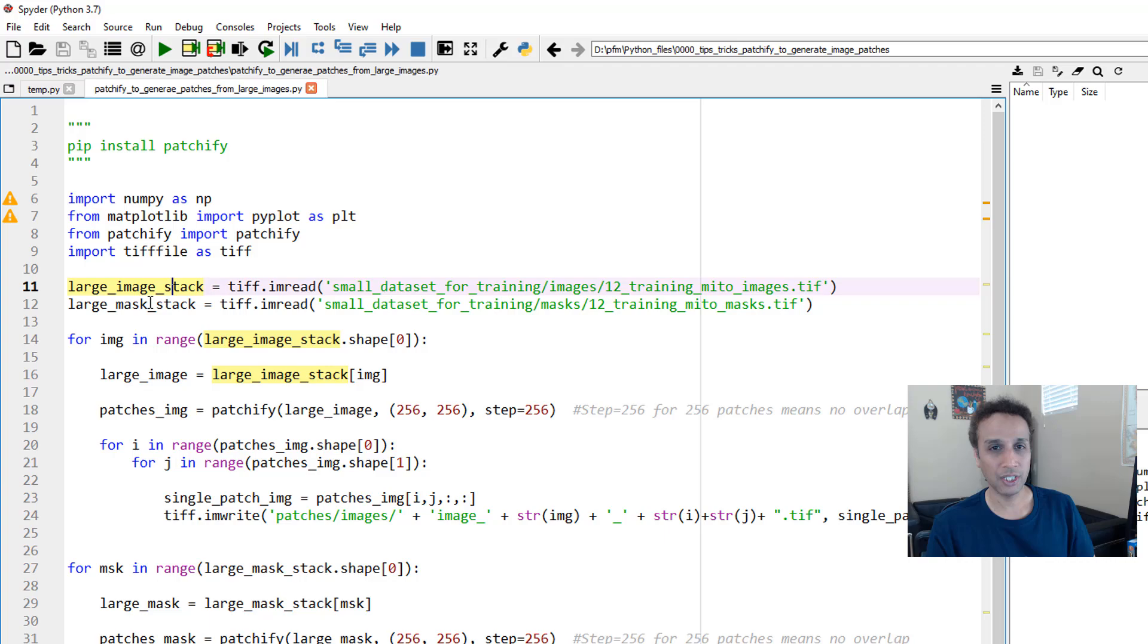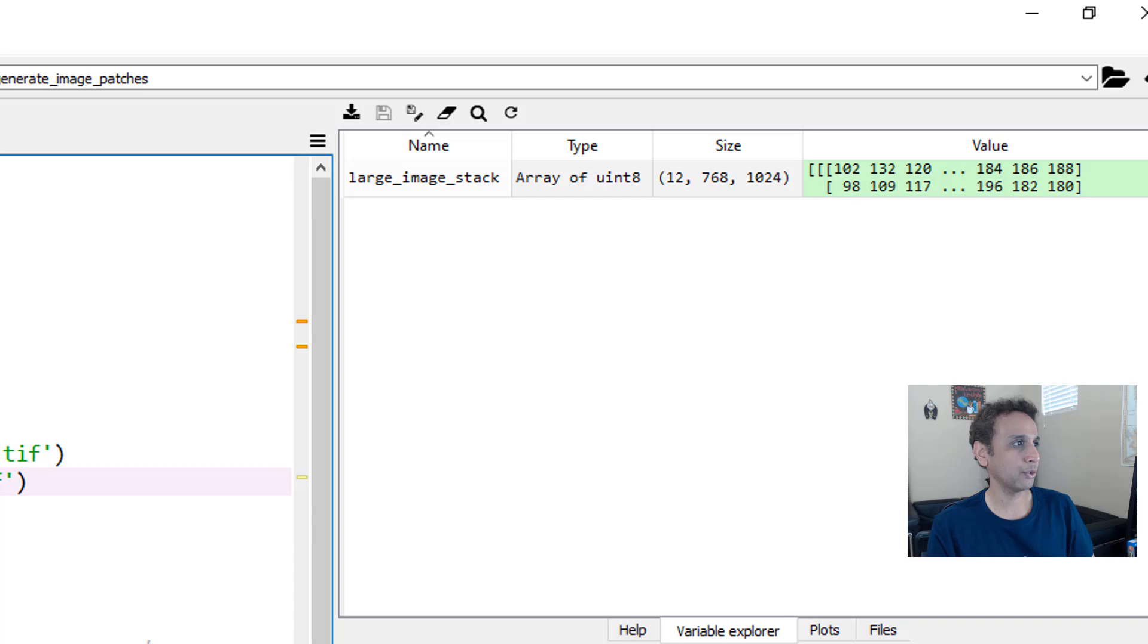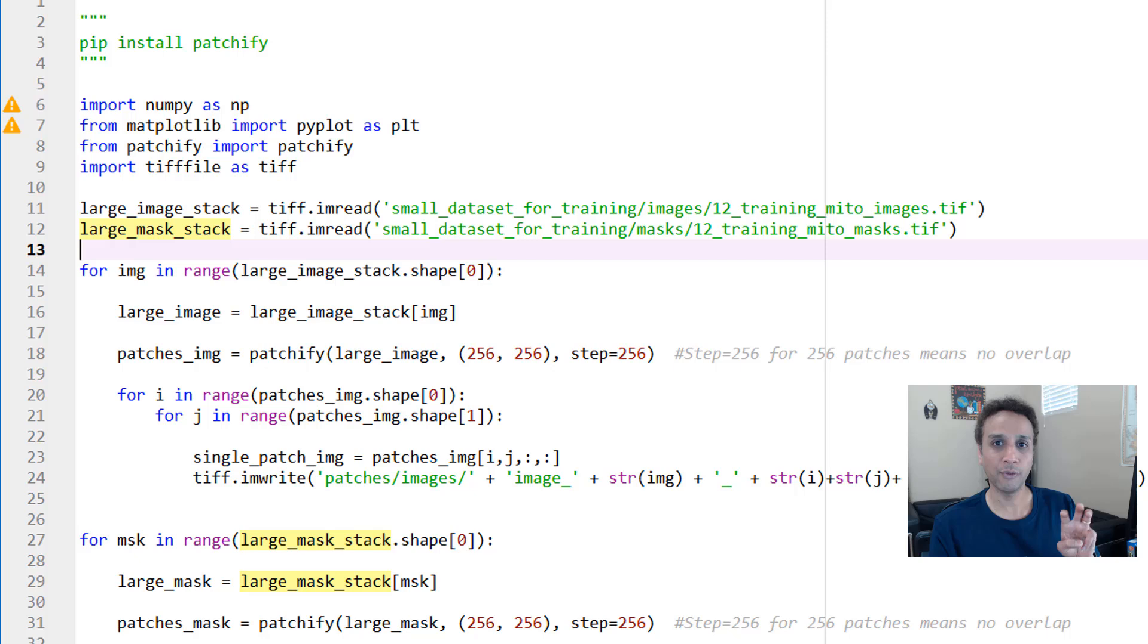Let's go ahead and read the large image and large mask stack. It's basically tiff.imread—that's it. So let's go ahead and read the image. As you can see, it's 12 images, each 768 by 1024. Let's do the same for our masks: 12 images, 12 masks, each 768 by 1024.